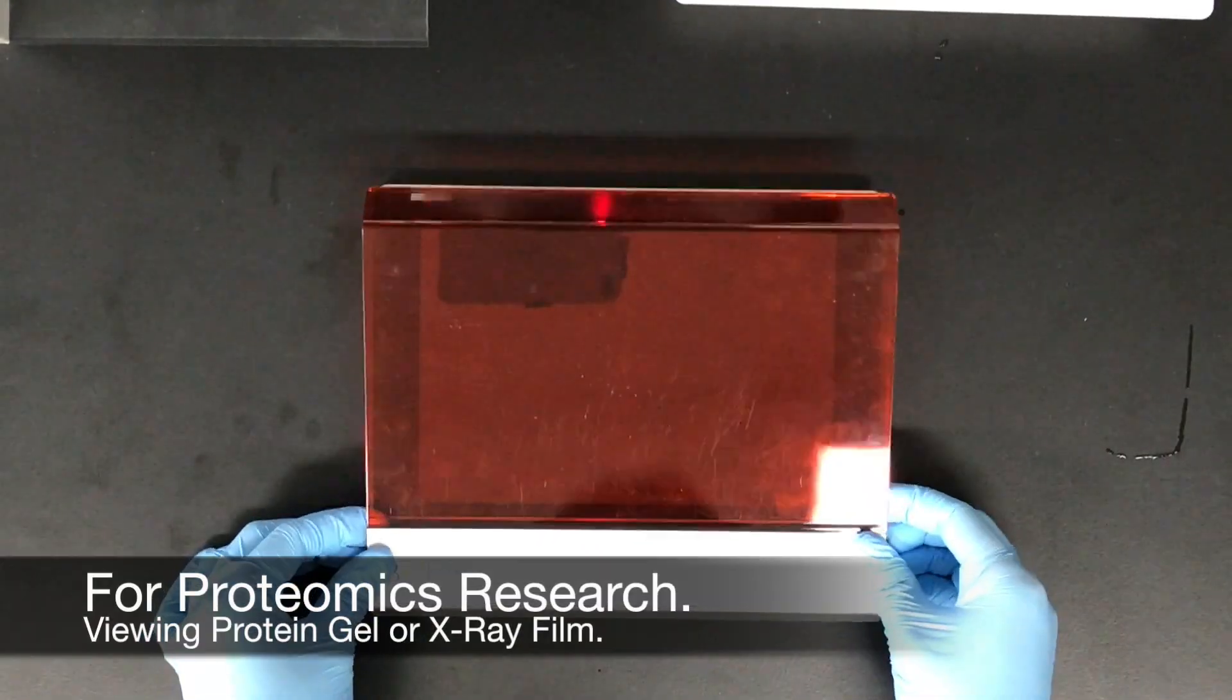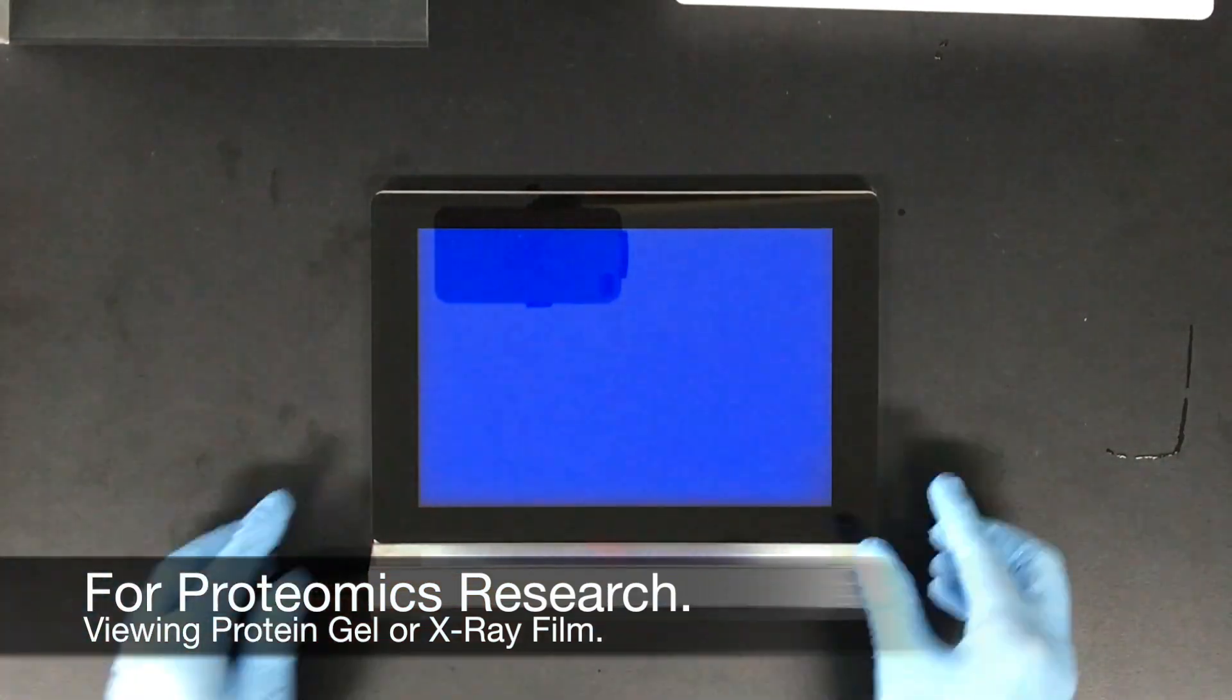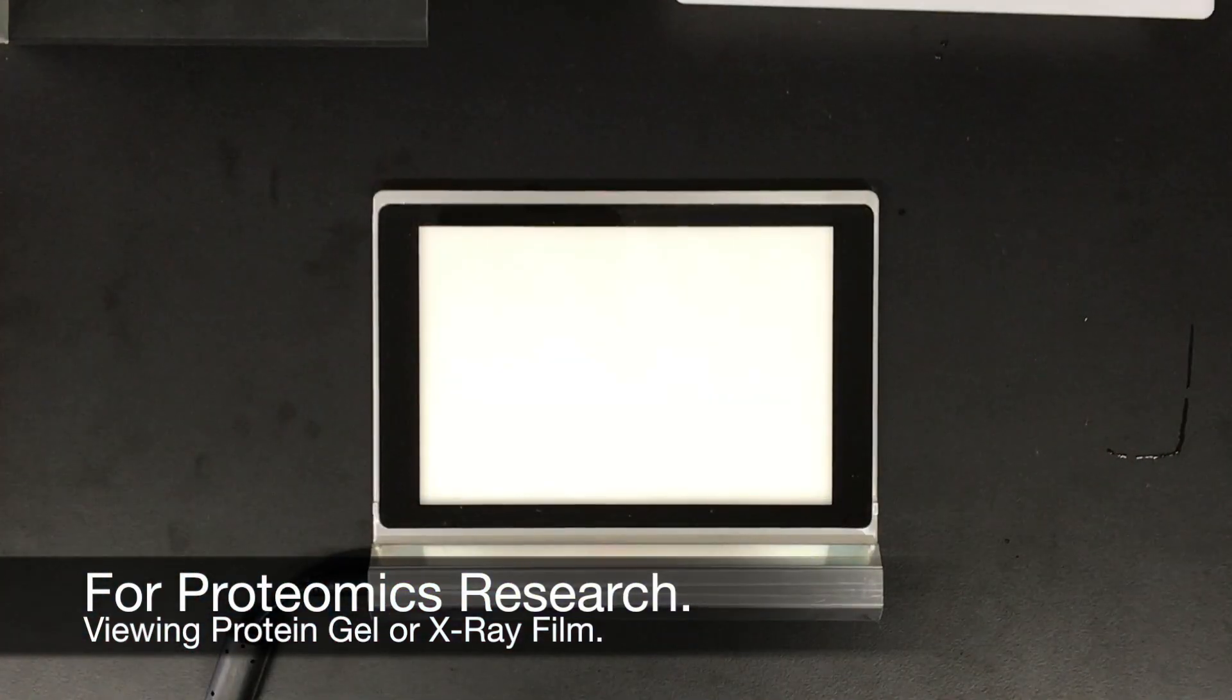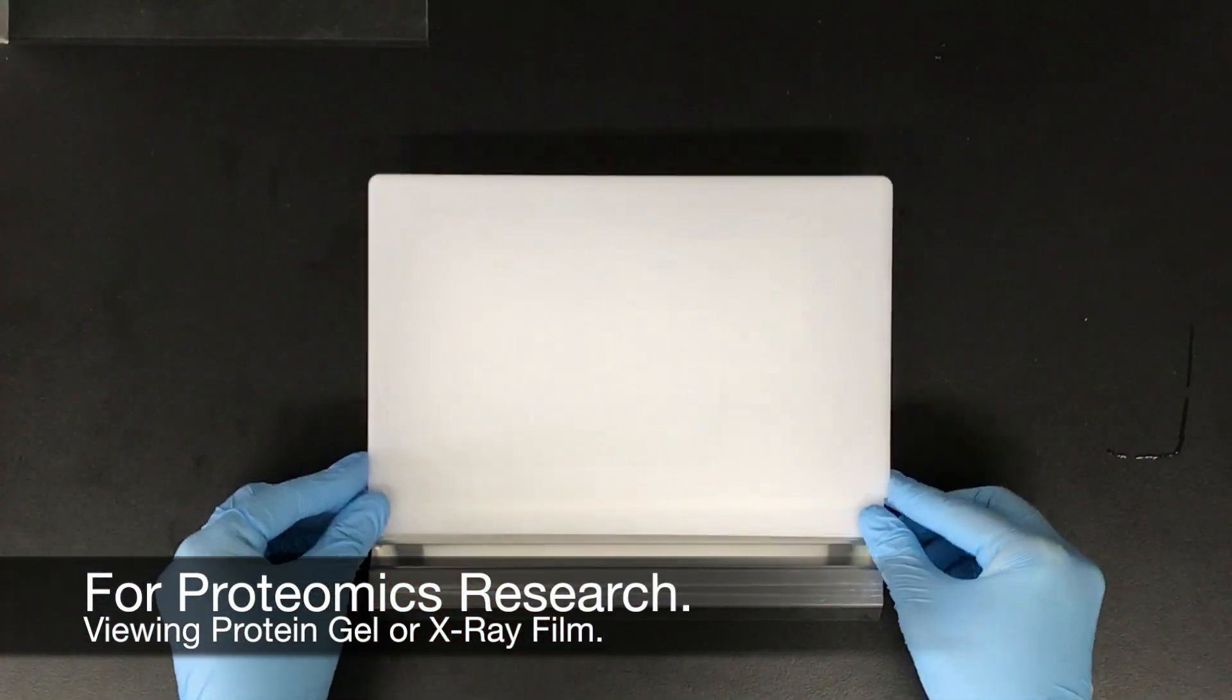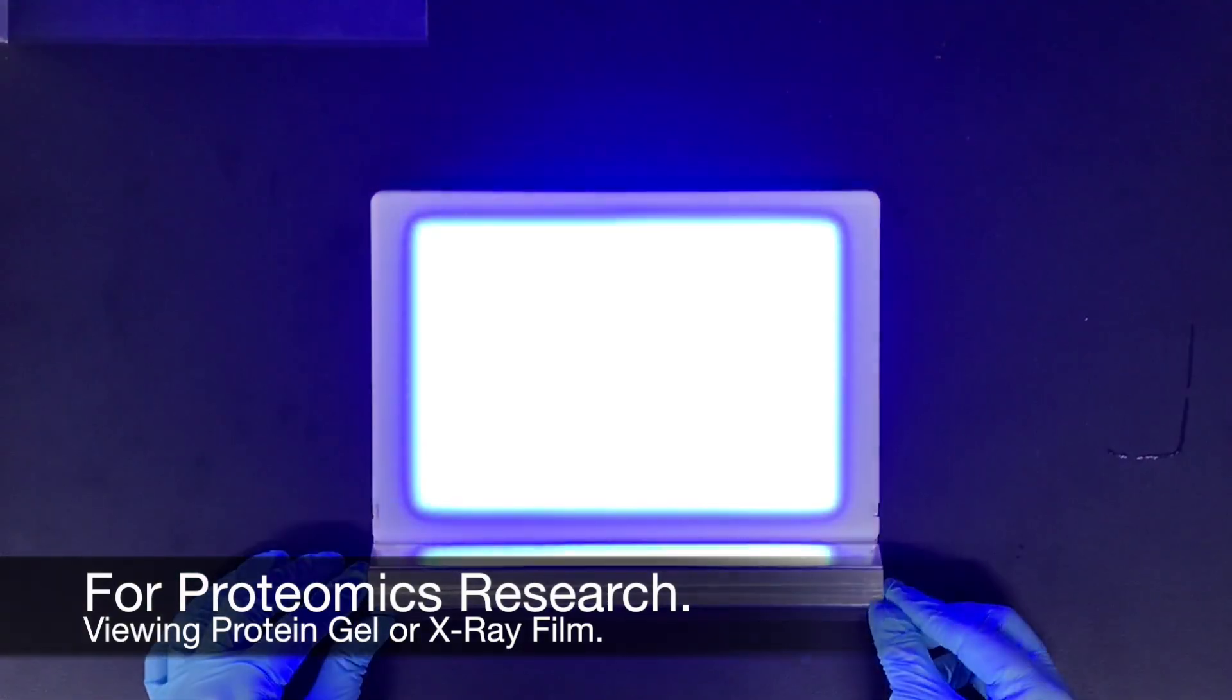When viewing the protein gel, however, one needs to switch to the LED white light mode with the white panel used and without the amber filter.